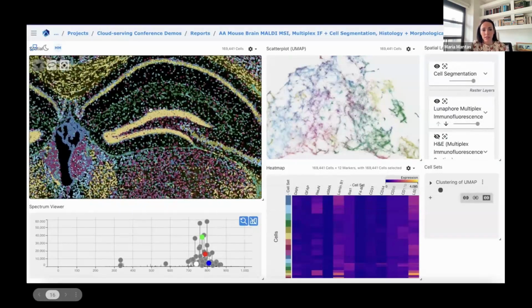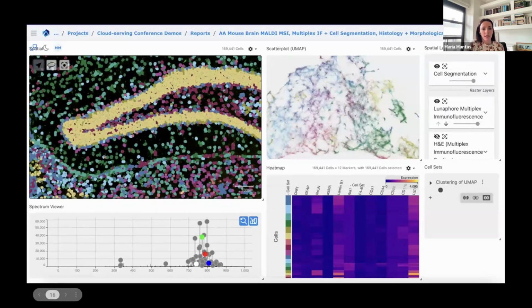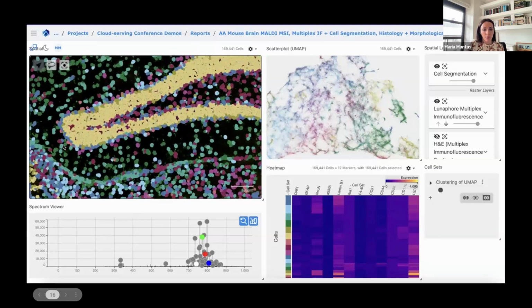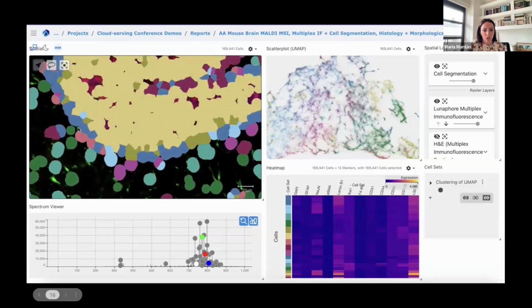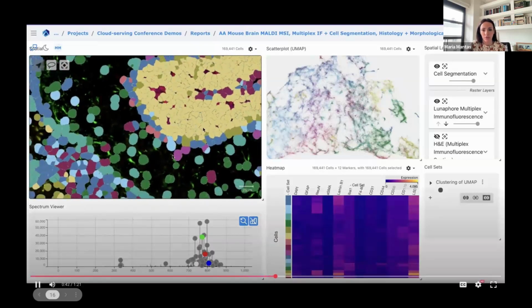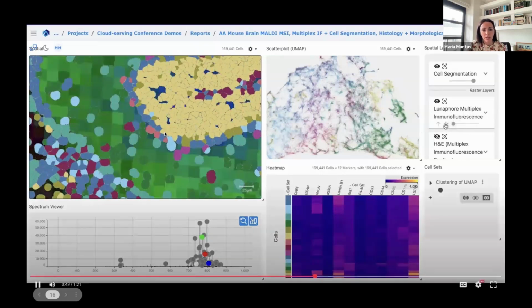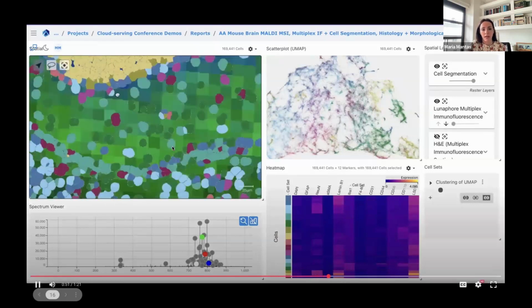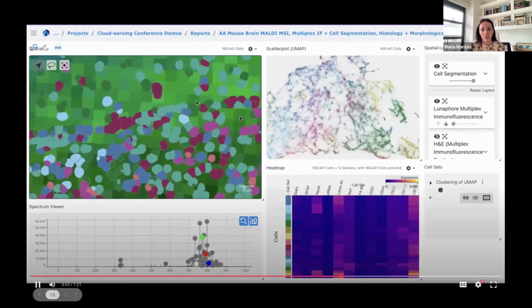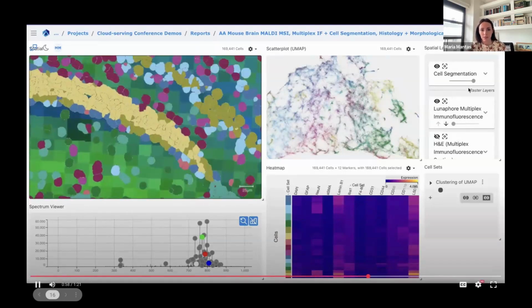It's at full-scale resolution, meaning that you can visualize individual cells. And as I move in to zooming in on this bit of the data set, I hope that you can appreciate that you can see the underlying COMET assay here underneath with the green fluorescence. Now I'm going to show the MSI data that is overlaid. So here you can see both the cell segmentation masks and the MSI pixels underneath. So they're truly fully integrated.